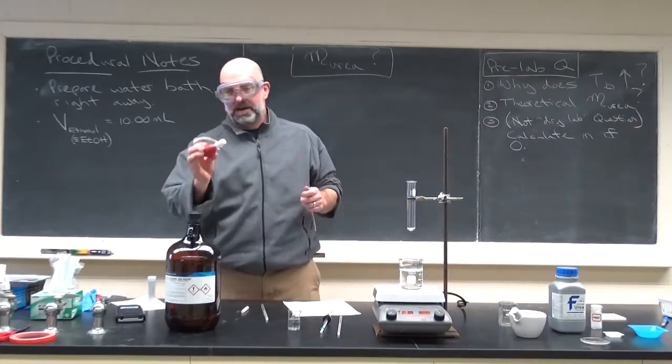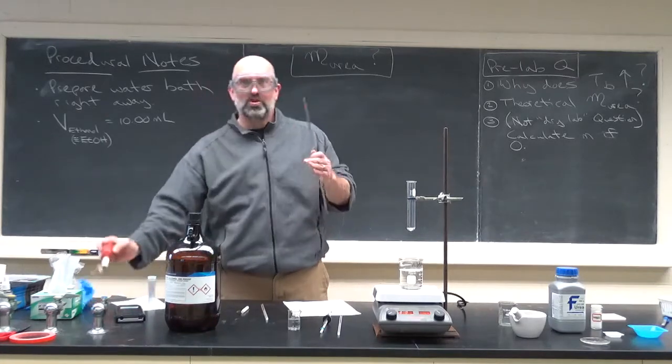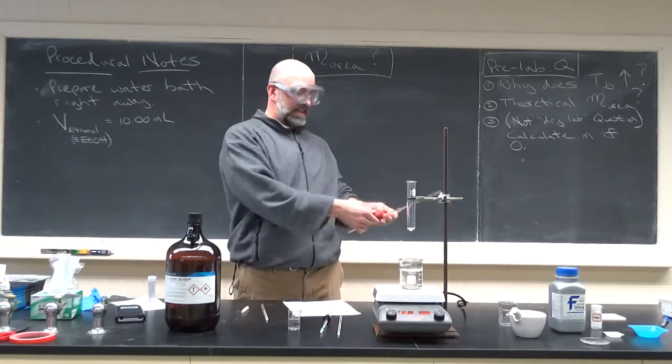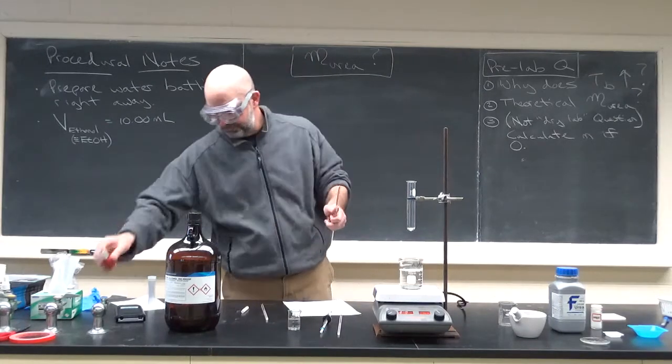Also make sure your pipette bulb doesn't have any cracks in it, because it won't draw liquid up or create that pressure differential. And I have a bad example here. This is one that was in the demo drawer up here, so we're going to throw that one away because that is not going to work.